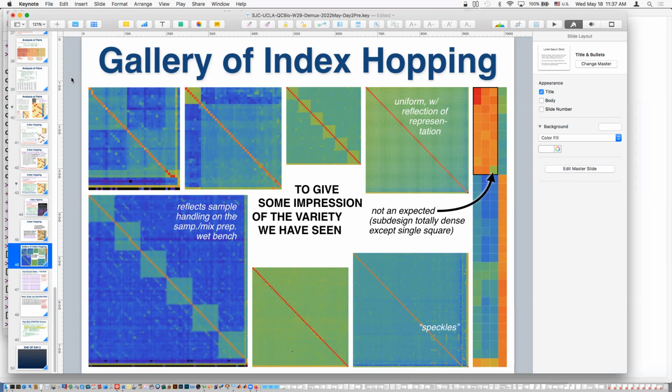And what you see is, okay, the diagonal, that's the expected pair. And the blue is low. Blue is like 1, 2, 3 counts, whatever. All these are the same kind of log scale. Where it goes blue, purple. I think black is a real 0.